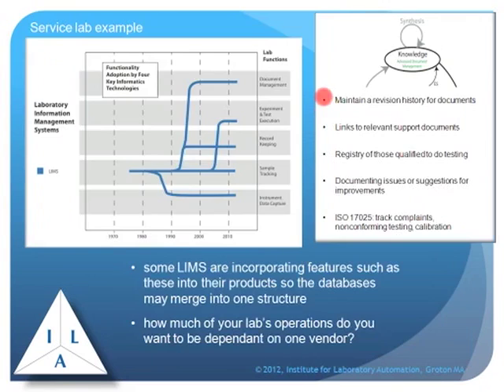We're starting to see these things, or have seen these things, affect products such as LIMS systems, where LIMS was primarily dealing, or initially starting in this range of tasks. It's expanded to deal with instrument data capture, and it's also taken on, in some products, the role of document management.